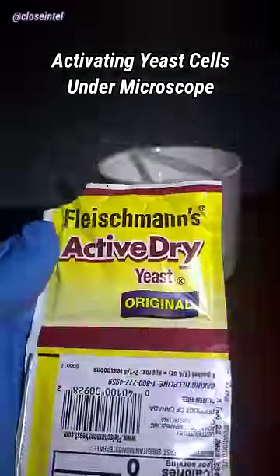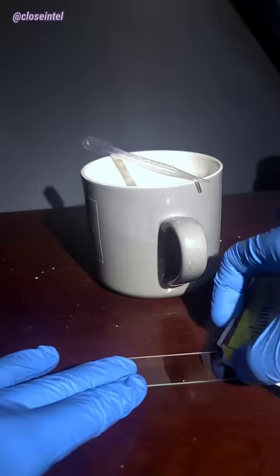Today I'm going to show you dry yeast activating under the microscope. A little bit of this stuff goes a long way.